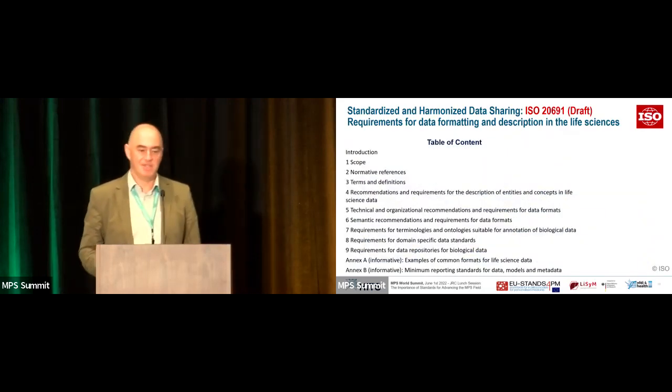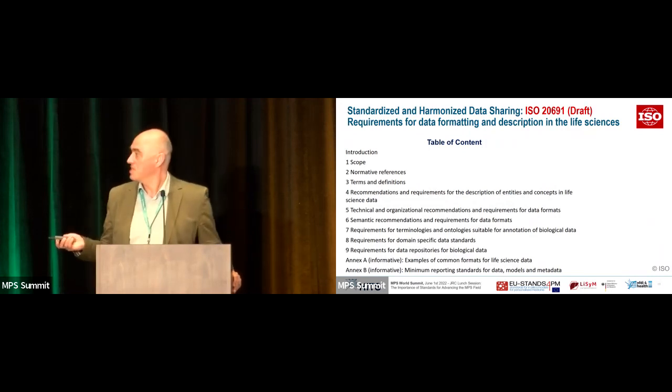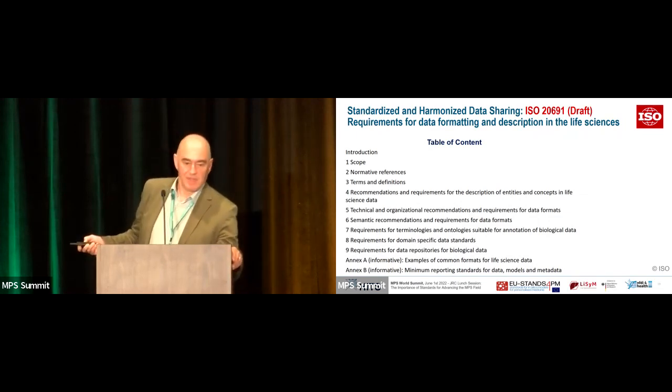The table of contents shows you that it's not only defining the requirements for the technical and organizational recommendations for the data formats and the semantic recommendations, but also refers to examples of common formats for life science data, and for the minimum reporting standards for data models and metadata.